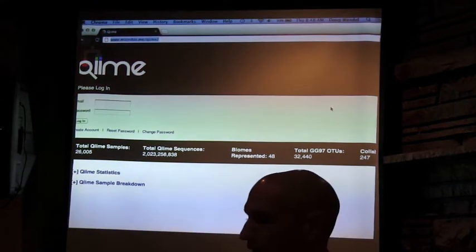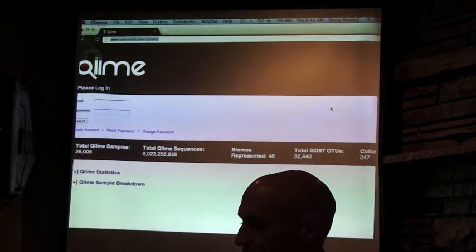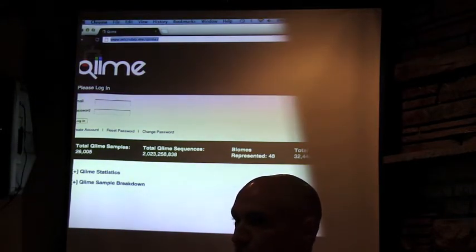All right. Okay, so I'm just going to walk you guys through the process of generating the metadata templates and spreadsheets, how those get filled out, how you upload metadata and sequence data to the website.